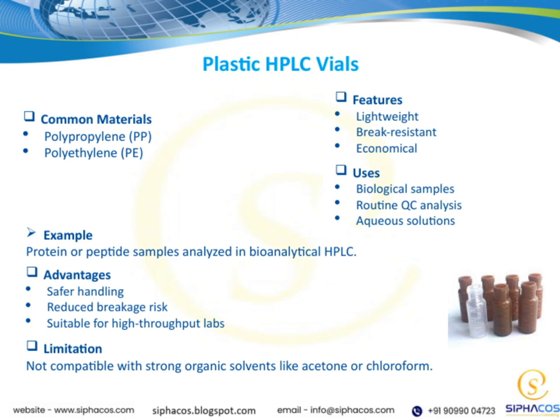They are also less likely to break compared to glass, which makes them especially suitable for high-throughput labs where efficiency and safety are paramount. However, it's important to note their limitations as well. Plastic vials are not compatible with strong organic solvents such as acetone or chloroform, because these solvents can degrade the plastic or cause contamination. In terms of features, plastic vials are lightweight and break-resistant, making them convenient for everyday use.